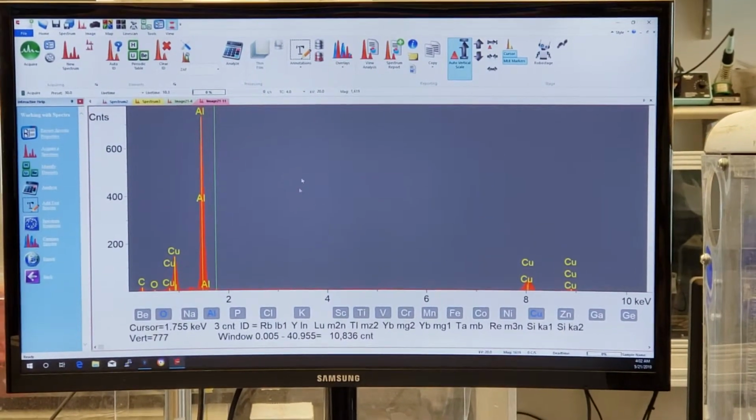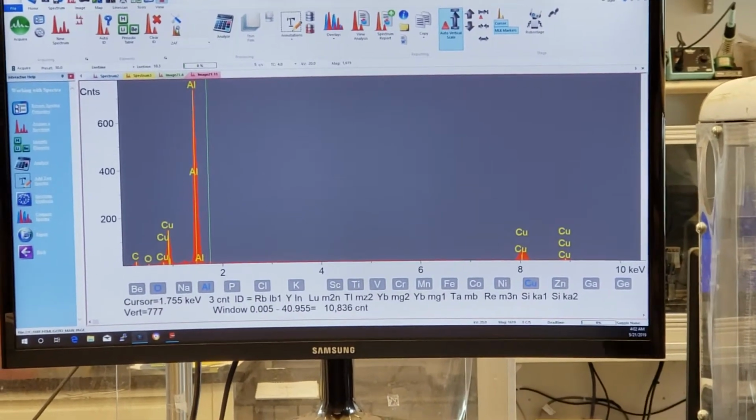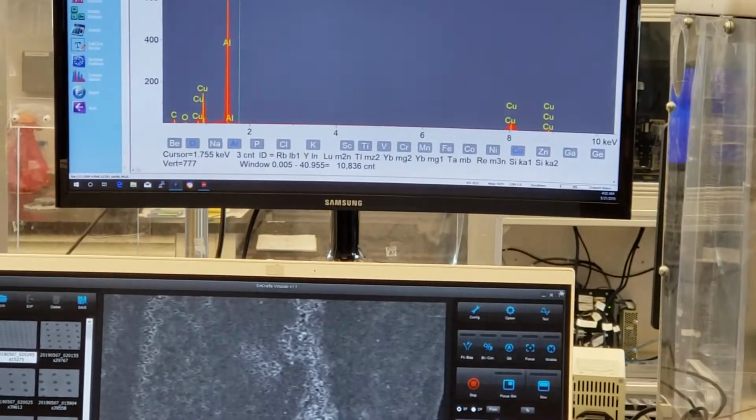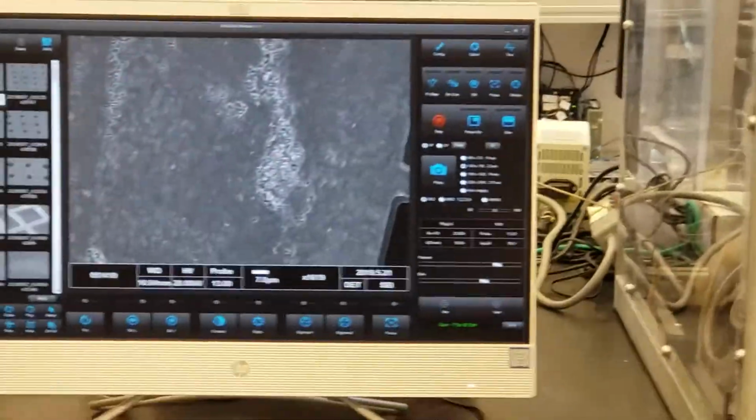Let's say we have a real beam. So let me do a real beam. That's better. It's better than working with fake stuff. Okay, back to real beam again. Let's kill this. Let's pay attention, Mark.